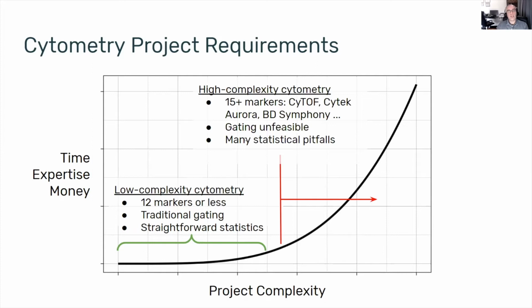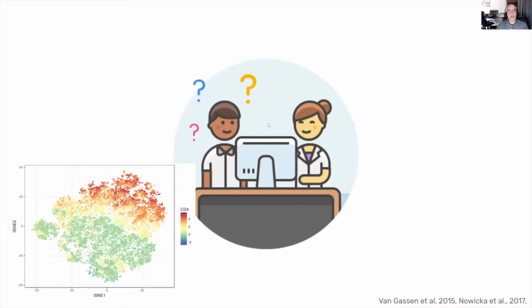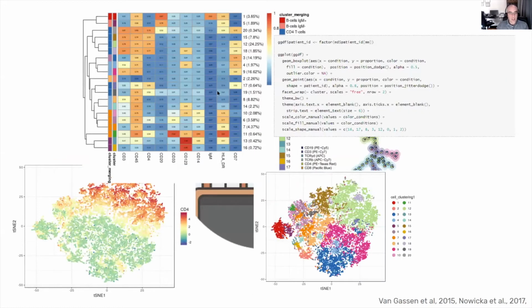So ideally, you would want to deal with these before you publish your paper, ideally as early as possible in the project. Now, many researchers acquire their data, and they're ready to analyze it, and they discover that the analysis is the greatest bottleneck for the project. And there's different tools out there. There's algorithms like t-SNE and FlowSOM. There's the R programming language.